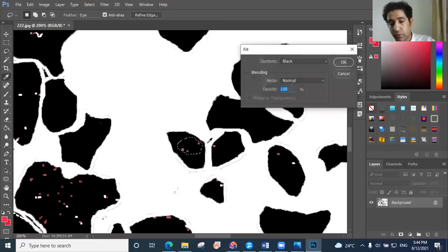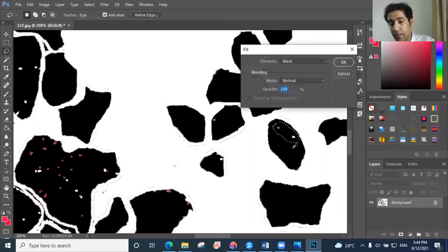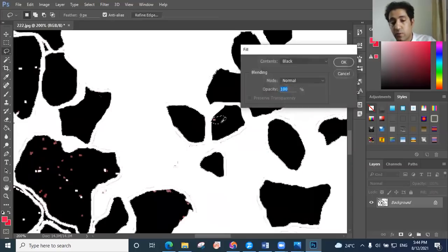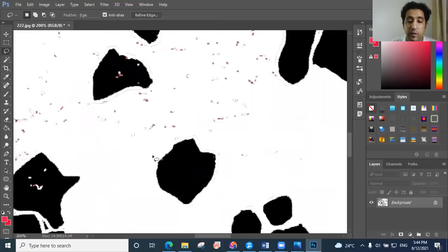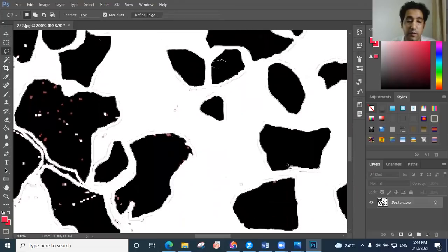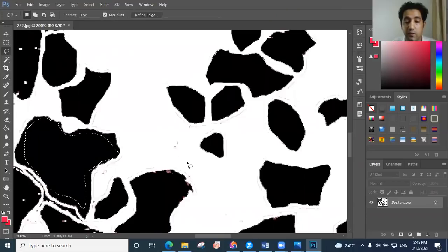It's better to choose a picture with black and white colors. If you use a picture with different colors, maybe you will face this problem. When you calculate the grain size, try to choose the grains with only black and white.